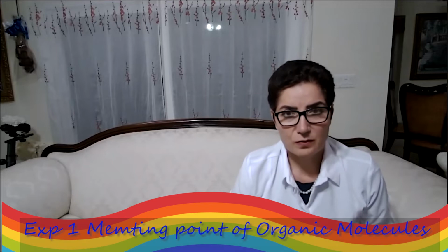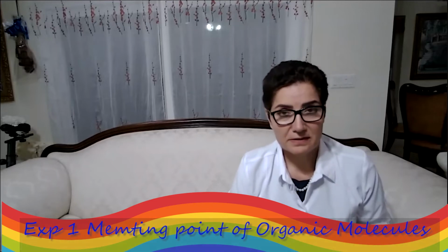Amari, and I'm going to start the pre-lab discussions for experiment 1 of organic chemistry lab, which is about measuring melting point and everything about melting point, all theoretical aspects and practical aspects of measuring melting point.